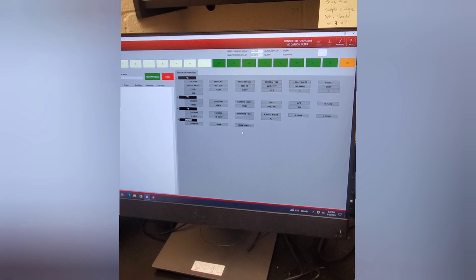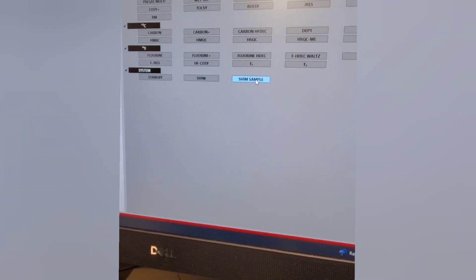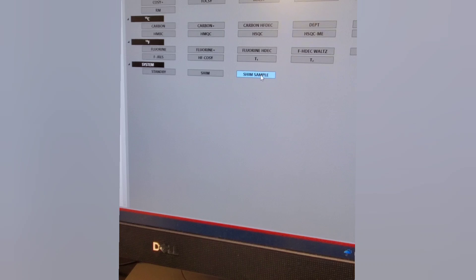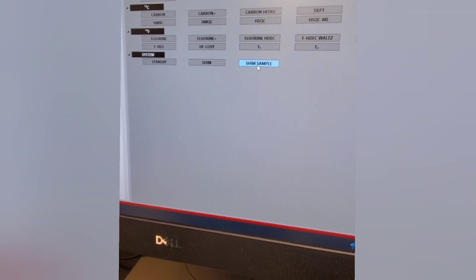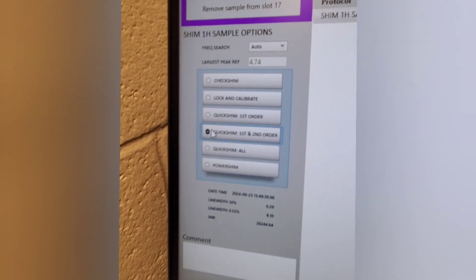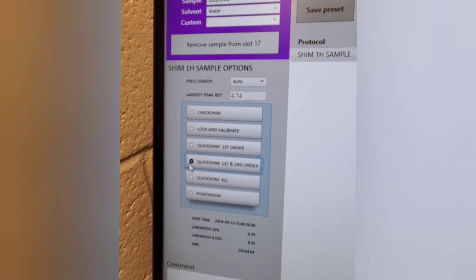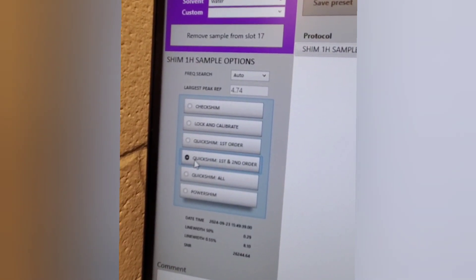In this menu we want to do two things. First, we want to shim the sample — this means we're going to optimize the magnetic field around the sample in order to take the measurements. We're going to click on 'Shim Sample'. I like to do a quick shim first and second order, so go ahead and highlight that. You could also do a quick shim first order, but first and second order is a little bit better.